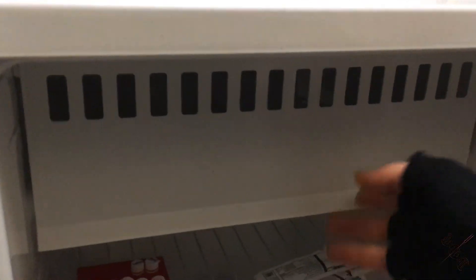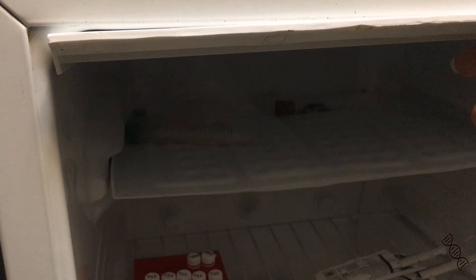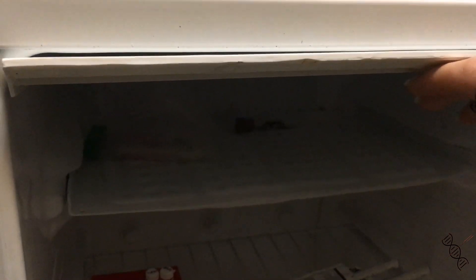Also, here is my integrated freezer. This is the place for my frozen antibiotic and IPTG solutions, also some calcium chloride for competent cells, and some plasmid and DNA.